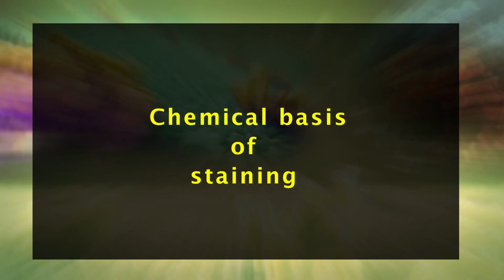This is achieved through the chemical properties of bacterial cell walls, where different colors are displayed after staining. This technique is based on the fact that the gram-positive cell wall has a strong attraction for crystal violet following the addition of iodine as compared to the cell wall of gram-negative. Iodine is the mordant and forms a complex with crystal violet, which is easily washed off from the gram-negative cell wall using ethyl alcohol. Now moving on to the next point, that is chemical basis of staining.